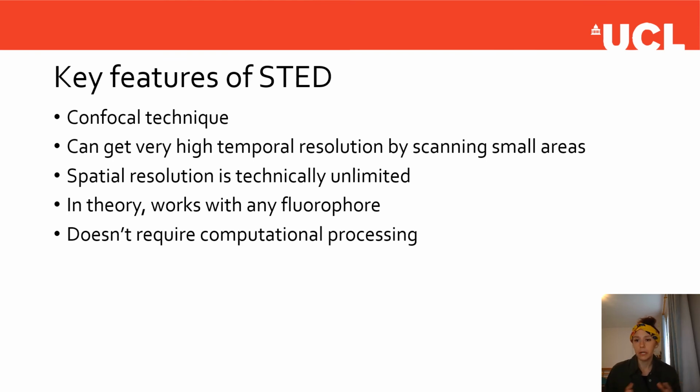And there are a couple of commercial implementations. So Leica make a STED microscope, and Abberior Instruments also do various STED microscopy platforms. Lots of the STED microscopy in reality has been done on home-built systems. The Abberior one's becoming very popular now, but the homebrew STED has classically got the best resolution so far.